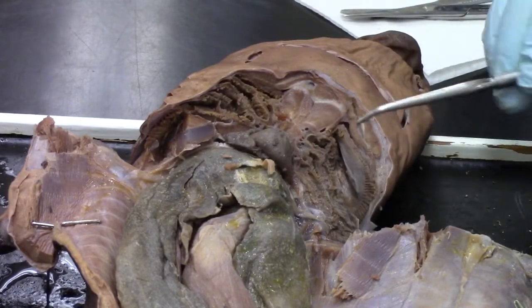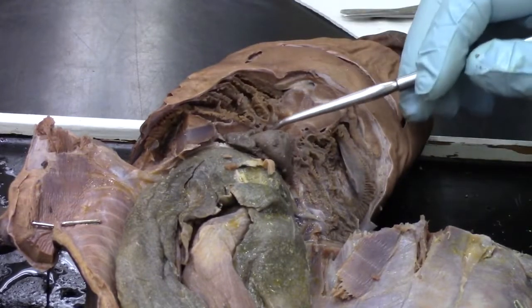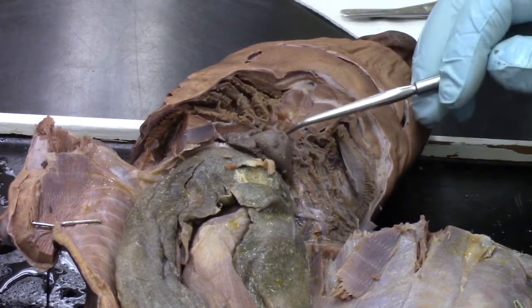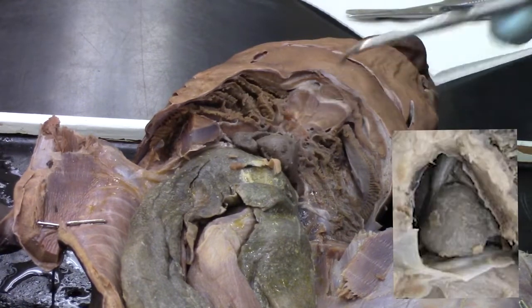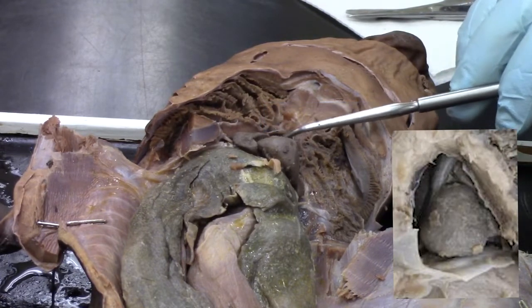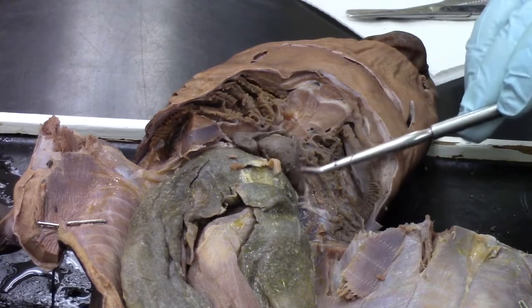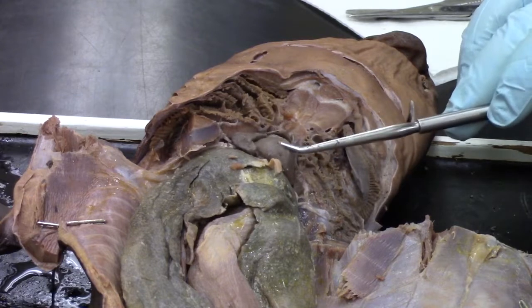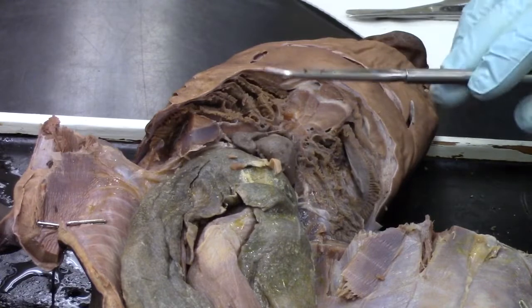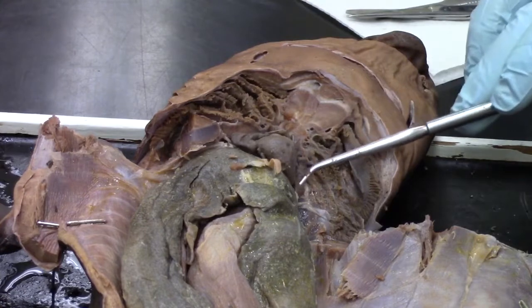So when I removed that piece that was covering this, I actually removed the pericardium, which is a thin membrane that covers the heart. If we take a look at the shark's heart, we start off here with the conus arteriosus. This large, most obvious part of the heart that we see here, that is the ventricle. It's going to be a little bit more firm and muscular. We can see a little peek of the atrium off to the side here.